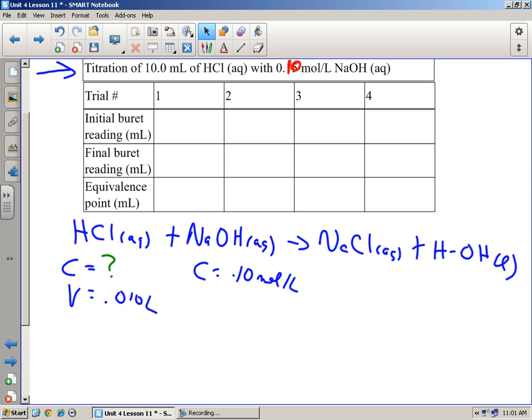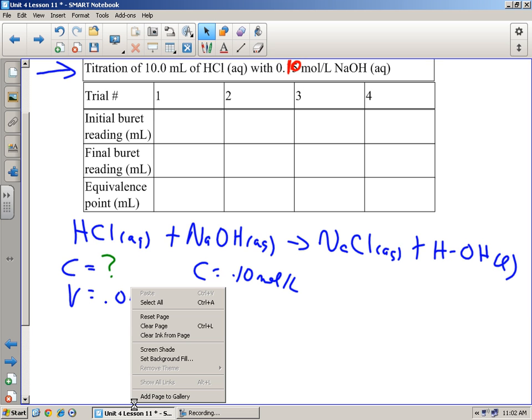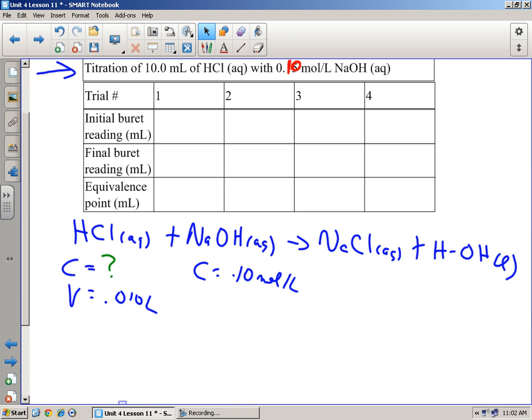We're going to add a little bit more. And I'm going to swirl it up, and it's going to go away. Now, don't panic tomorrow. Listen, if you start adding some titrant and nothing happens, the first thing you should say is, did I add the indicator? Because if you didn't, then you probably should stop and do that right away. But if nothing happens, that's okay, because it may require a lot of the titrant to actually start to change that color. Okay, so I'm going to add a little bit more here.